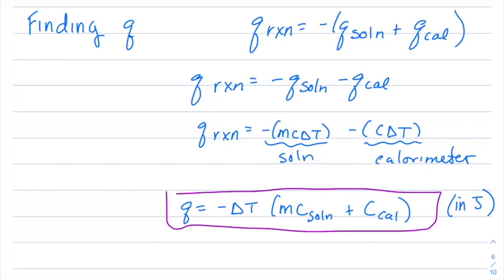Even when I was a grad student at Notre Dame, the freshmen still got coffee cup calorimeters. But again, we splurge on you, and she didn't show it in the video, but we give you a double layer of aluminum foil. So only the best for our students now. But again, even at Notre Dame, they got aluminum foil for the lid. So this is a very common experiment.